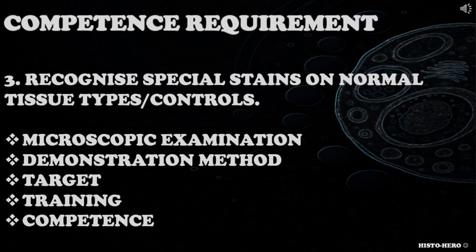When addressing this competence requirement, candidate could consider correct microscope setup and use, demonstration methods for carbohydrates, lipids, pigments, minerals, infectious agents, and extracellular proteins, microscopic examination of stained slides, demonstration method used and the target elements they highlight, their training and competence.